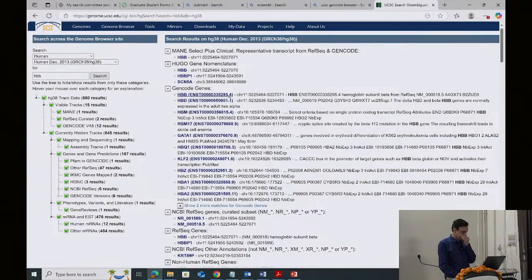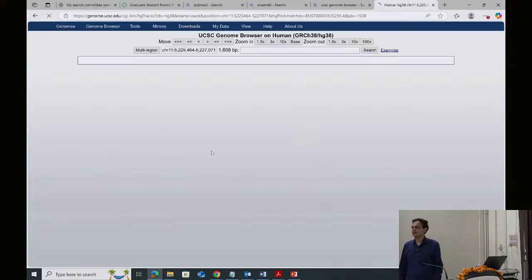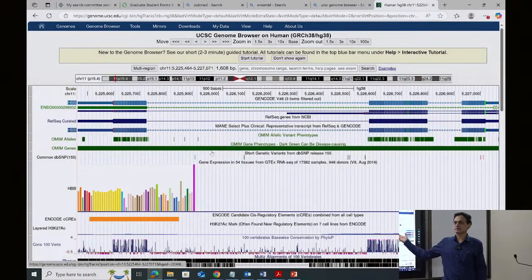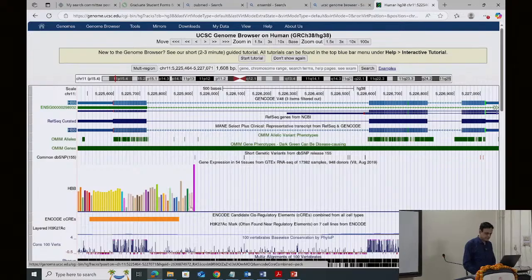Okay, HBB. So we will select HBB here. I don't know actually. This is really slow. Sometimes the connection is slow, sometimes it is fast, but don't worry, we will be able to. Here it is.